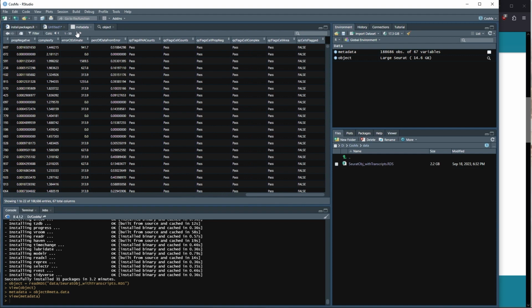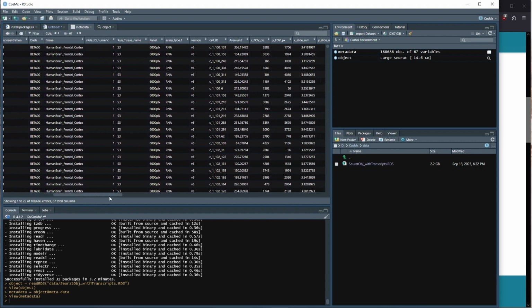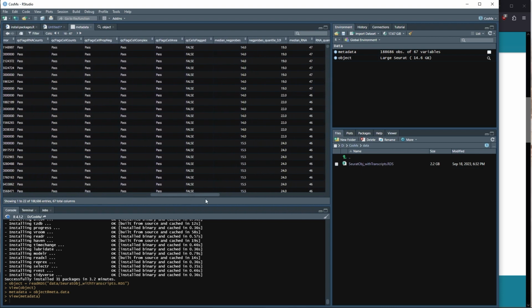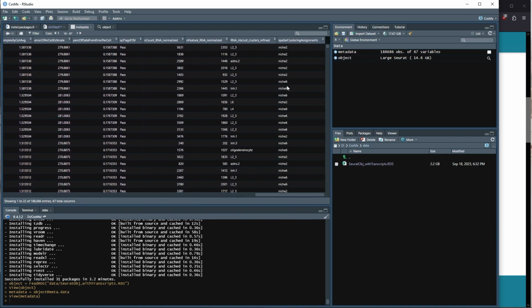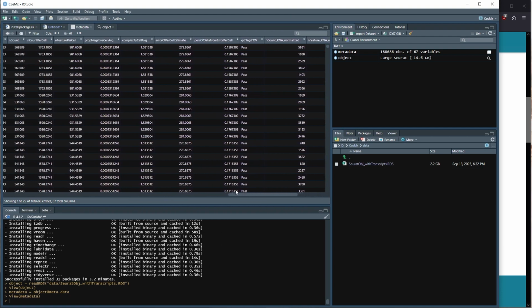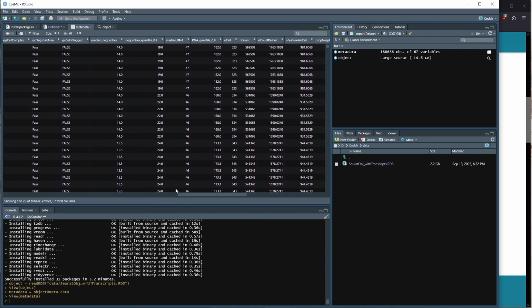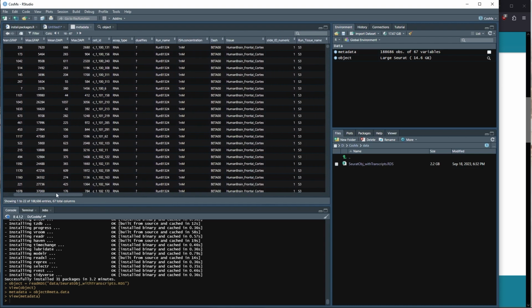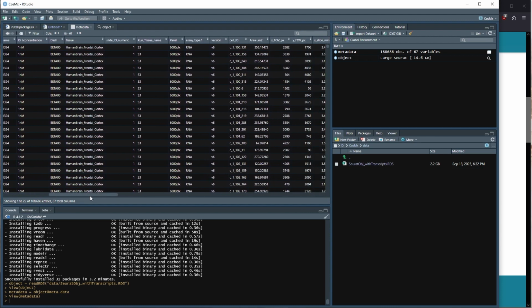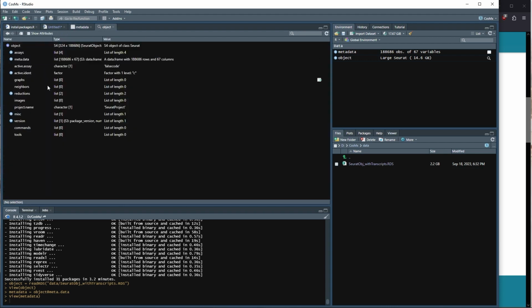I think we'll have to go to the next page to see phenotypes, if they have phenotypes assigned. I'm not seeing it, actually. The last columns. So we got niches here. I don't see the cell types, though, which is interesting. So yeah, this video is just exploring. You can see the median RNA. I thought they had, or would have had, some phenotypes in here. All right, let's go back to our object and keep looking around.